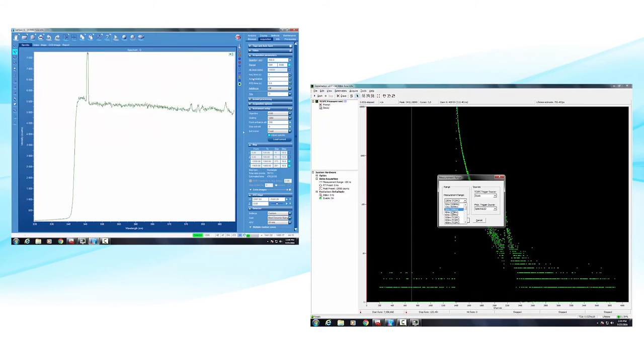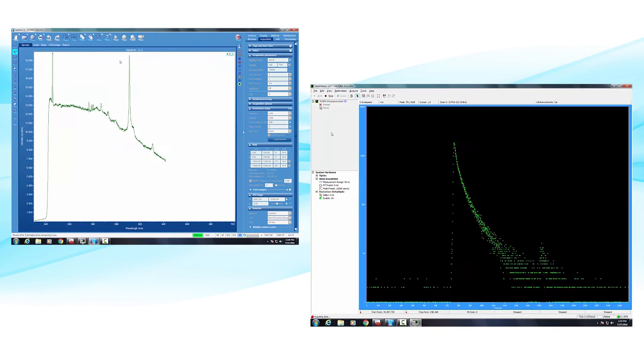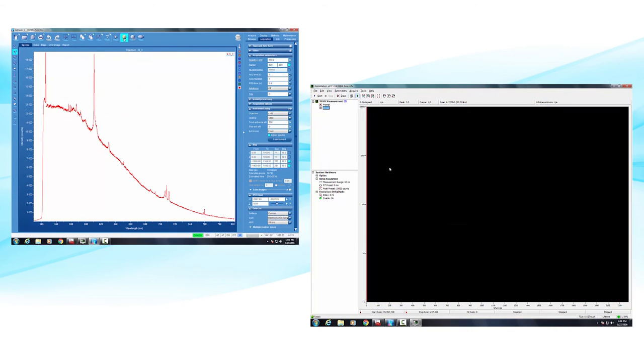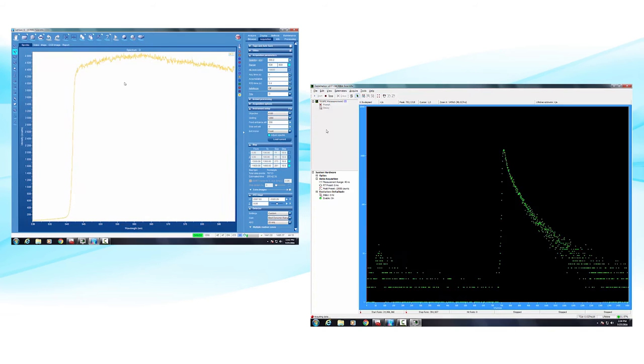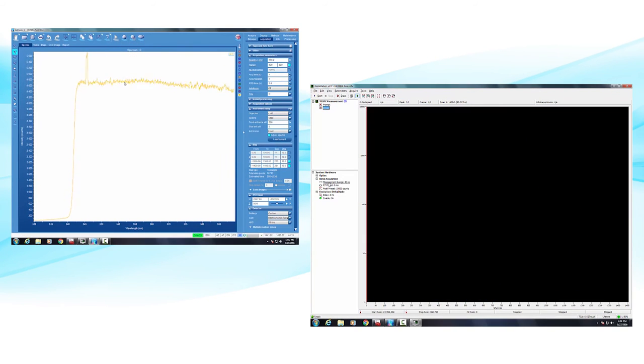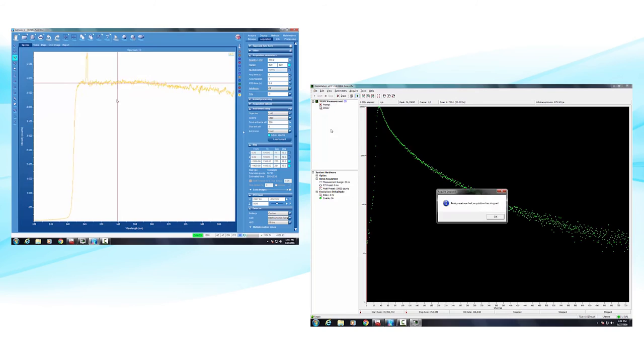Because both steady-state and time-resolved measurements are performed on the same system, co-location of the sample is easily attained, eliminating the need to move and realign the sample between instruments.